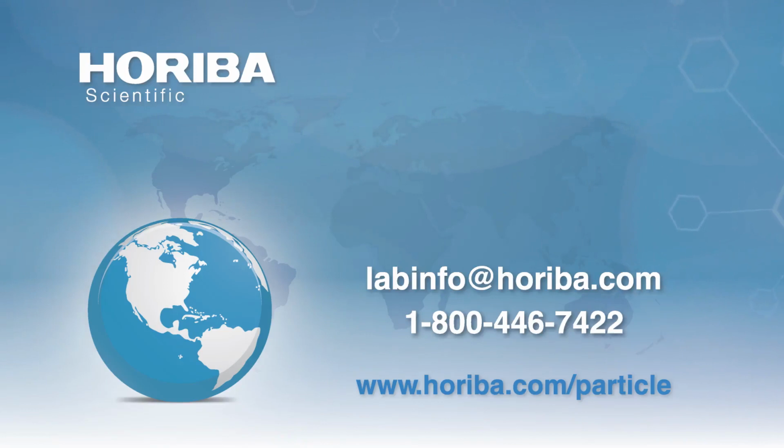Now, the next question is, how long does it take to run a single sample? So it takes about 15 minutes. I think it's 12 to 13 minutes, and I throw in 2 minutes for bobbling the cell or whatever things I do at that time. So that's where the 15 comes from. Now, one thing you can do to boost throughput is run a bunch of samples at 6 minutes each, and then do all the analyses overnight when you're not in the lab at 7 minutes each. If you really need to boost throughput, you could do it that way.